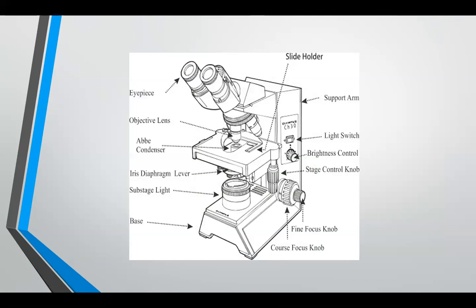So this is a great slide. You guys have to fill out on your sheets and label a microscope. So if you want to pause the lecture video here or download the PowerPoint, but this is a great slide to use to do that part of your worksheet to label the microscope.